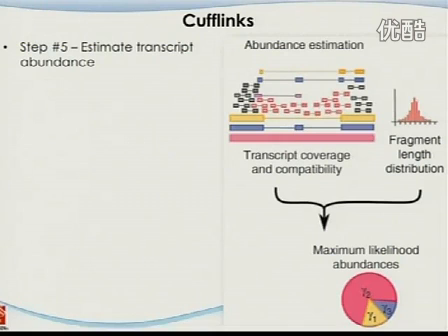Clearly this one is the yellow one, this is the blue one, and this is the purple one. So all the reads that support this red one, the purple one, are labeled with the same color. And there's one thing you cannot see very clearly, which is this one, this read.